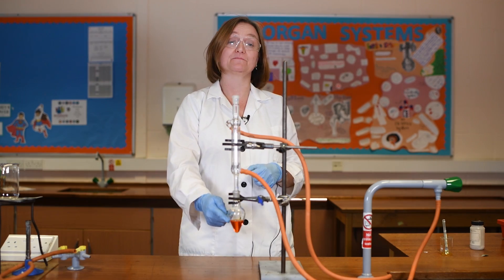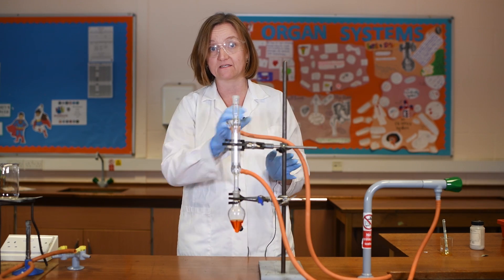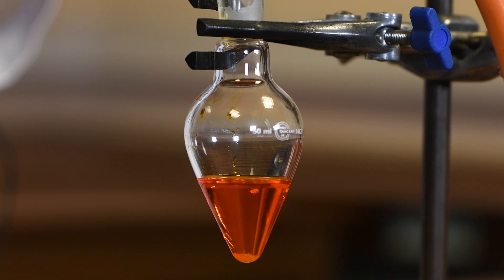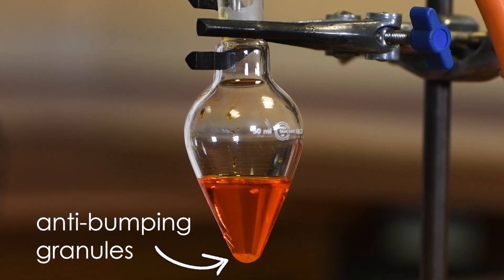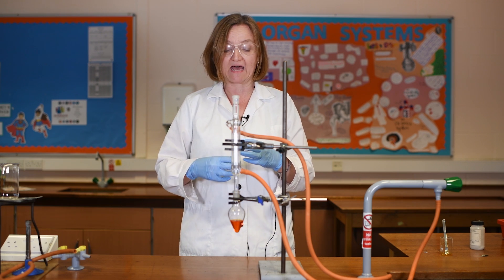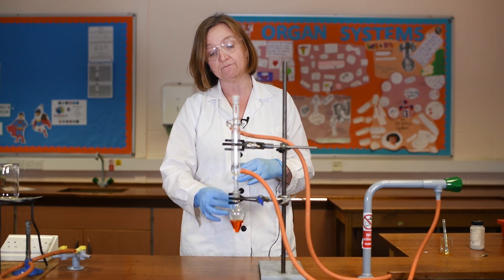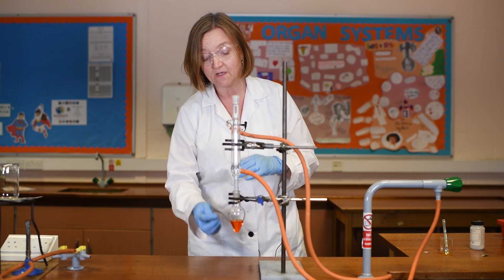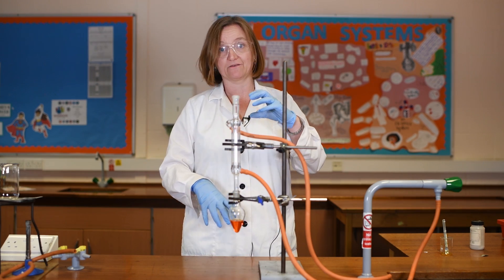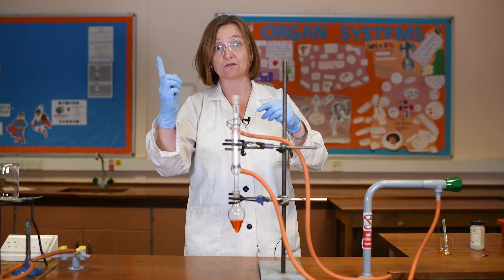I have now placed my acidified potassium dichromate solution into my pear-shaped flask. I did that by removing the condenser and pouring it carefully through a funnel into the top of the flask. I've also added just a few anti-bumping granules. These are small grains of an inert plastic that provide a large surface area so that as the mixture starts to boil you get a series of small bubbles forming at the bottom of the solution, so the whole mixture bubbles nice and gently. Without them, you've got the risk of large bubbles forming which could make the solution go blop, blop, blop and push right up into the condenser.